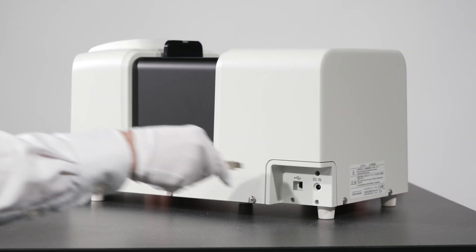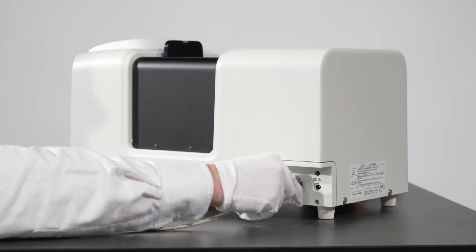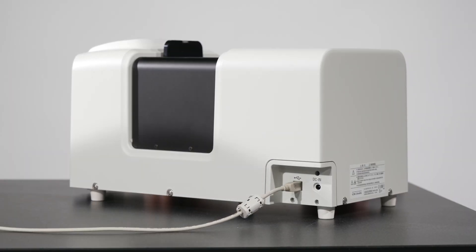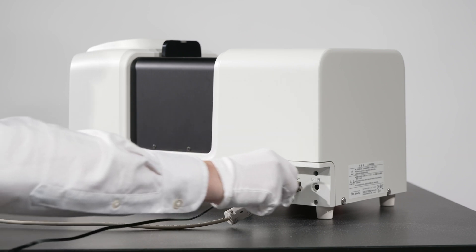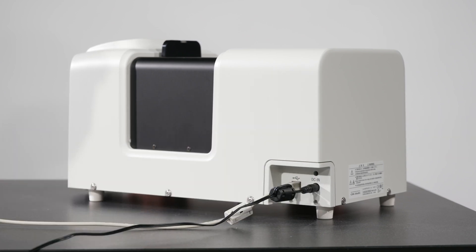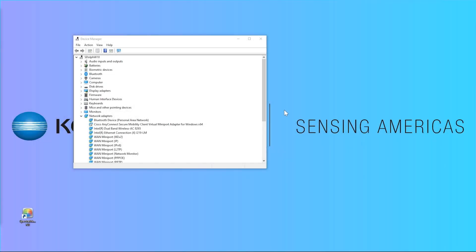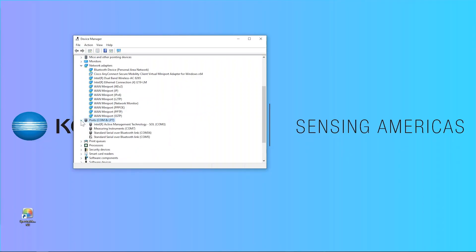When connecting the first time, check which communication port has been assigned by opening Device Manager. You can do this by right-clicking on the Windows Start icon in the lower left corner and select Device Manager from the pop-up list. Scroll down to Ports, COM and LPT, and expand the tree to see which port the instrument has been assigned.